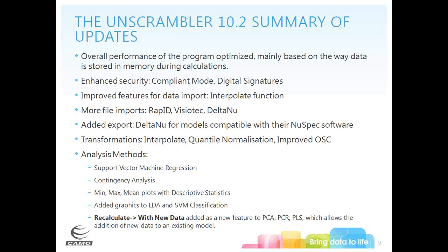We've added additional transformations, including improving our orthogonal signal correction, OSC, which I'll talk about a little bit more. And we've also added additional methods. The most large change has been the addition of support vector machine regression, but we've also added contingency analysis, min, max, and mean plots with descriptive statistics, and graphics for classification done using linear discriminant analysis or support vector machine classification.